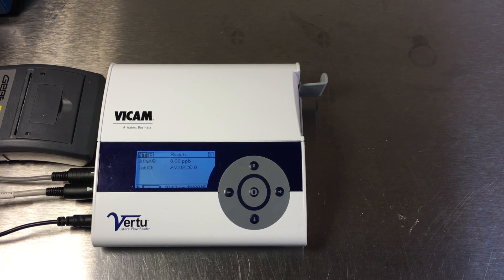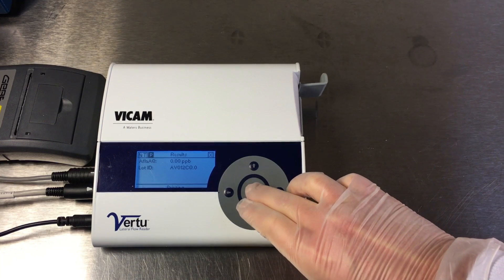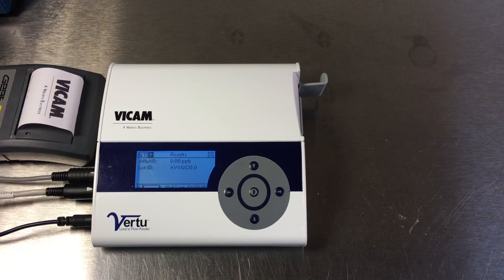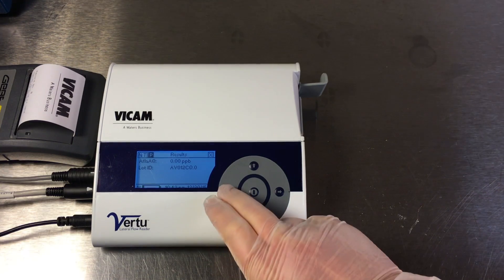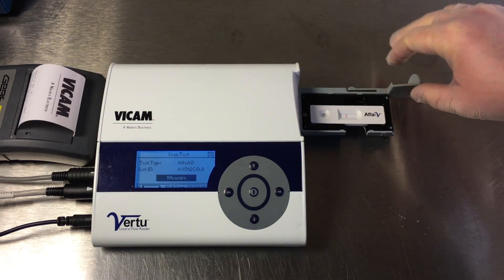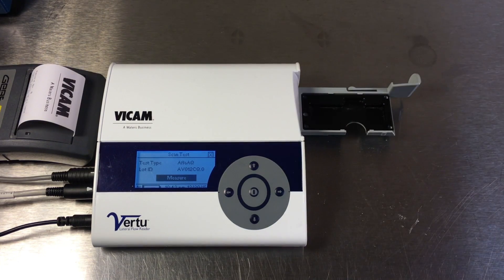After the results are displayed on the screen, press the right arrow button to select the P option. Press the center button quickly. Results are now printed. Press the left button to select the NT option, then press the center button quickly. You are now ready for the next test.